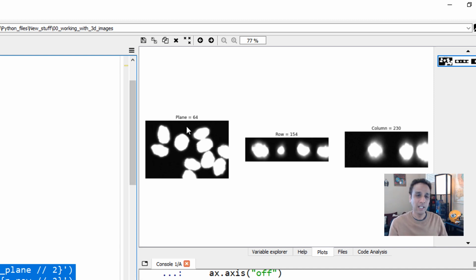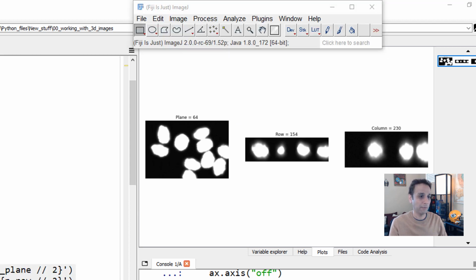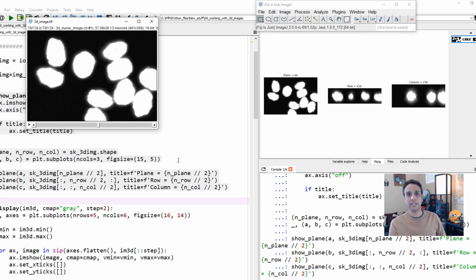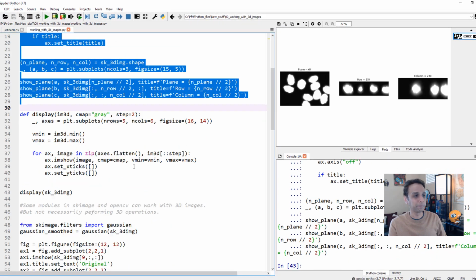Sorry, I'm looking at the 50% of this, somewhere in the middle, this slice. So this is from the top, and from the side you're seeing the cross section, and this is the other side of the cross section from this direction. So that's just a quick visualization there.